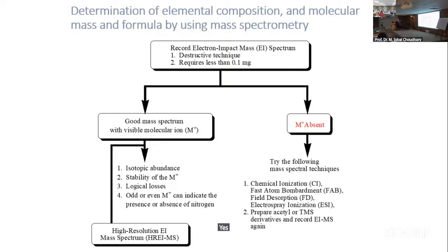Yes, to convert organic sources, we have methods. If you have organic salts, then definitely. Complex organic material, we have methods inside. Yeah, then here is another point: you are putting your sample in a magnet.